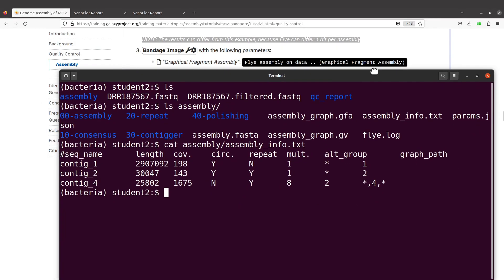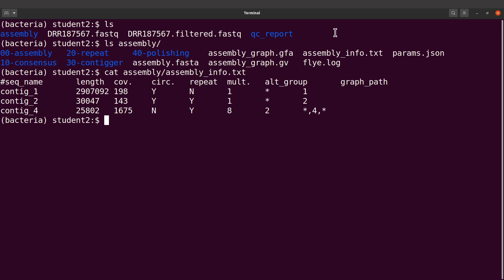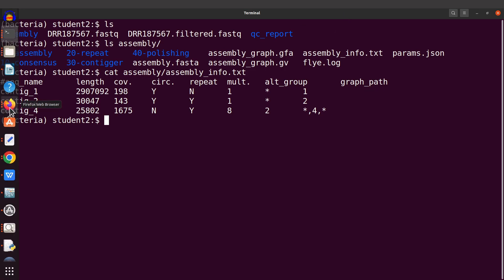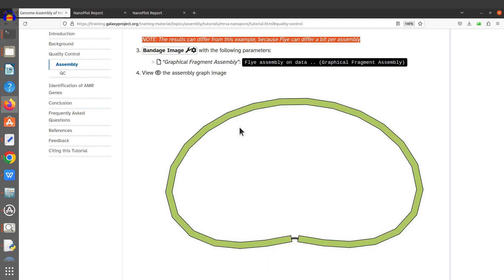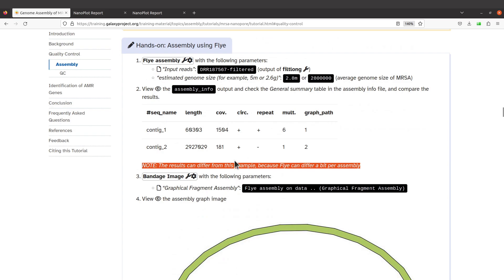All right, so after doing the genome assembly, it's possible to visualize by looking at the contents in the assembly graph. We can visualize it. Let's check the Galaxy tutorial page and see what was done.